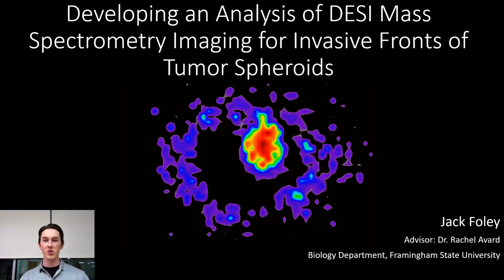I'm a senior biology student at Framingham State University, and I worked with Dr. Avard on developing an analysis of DESI mass spectrometry imaging for the invasive fronts of tumor spheroids.